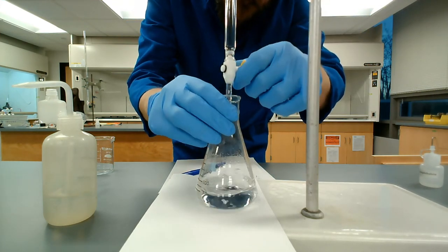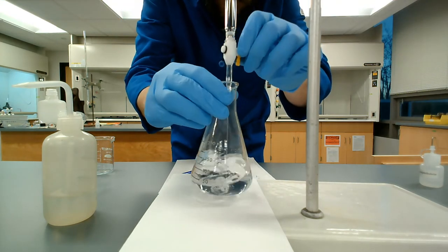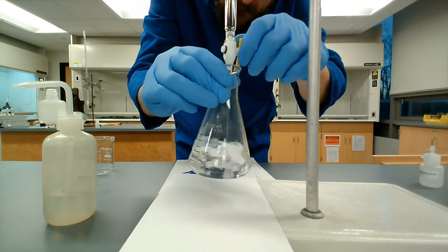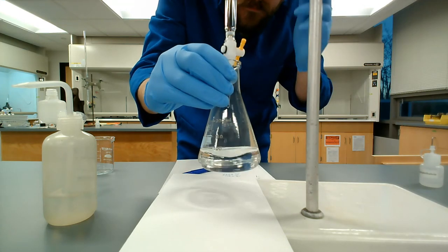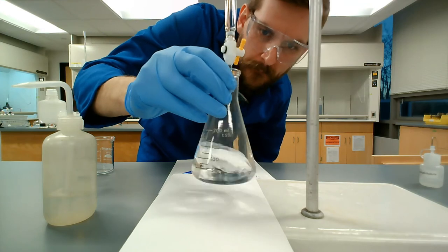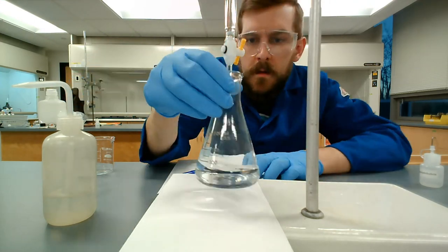Once I see pink pools start to persist in the bottom, I'll slow down a bit. I'll start swirling vigorously. So swirling, swirling, swirling, while it's still a wide open stream. I see a pink start to persist while I'm swirling, and I'll slow down to like a drop a second. Drop, drop, drop, drop, right? Still swirling a lot. I'll periodically stop swirling, and that's when I think I'm seeing pink, but I'm swirling so fast that I'm not sure if I am or not.